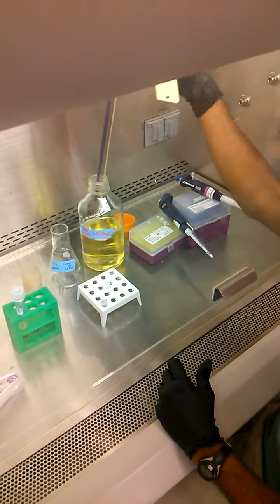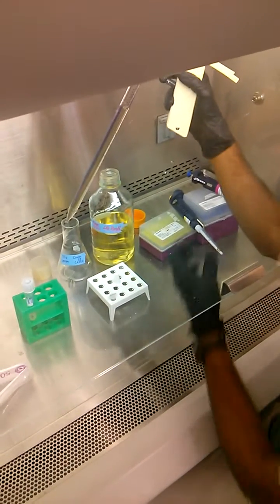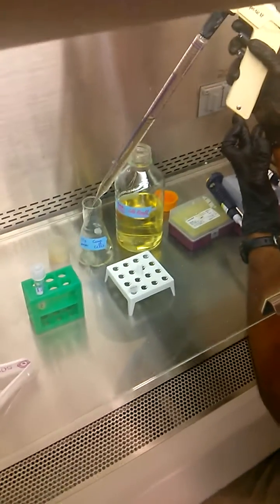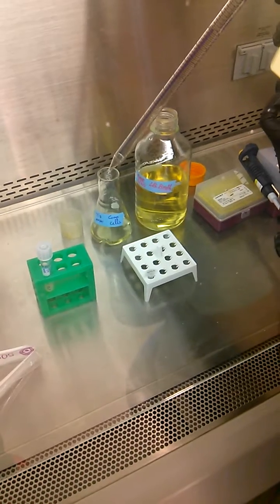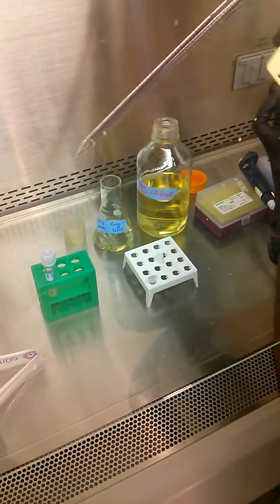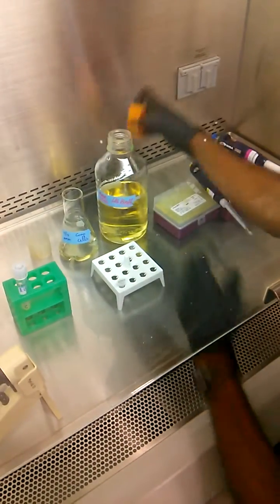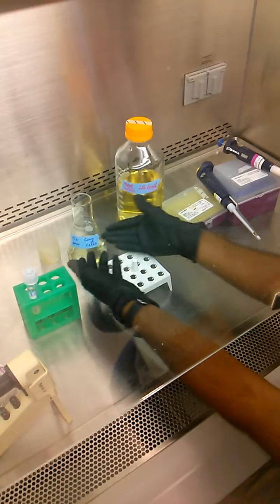There's about 50 mils — the exact volume isn't too important here. Now I'm transferring it. So I have my 50 mils of LB in the flask.